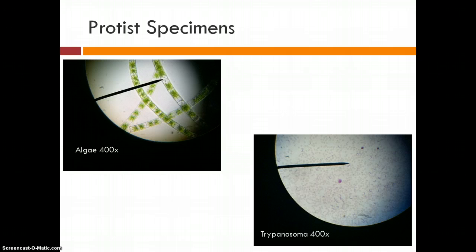So it's important to wear gloves while you're handling the blood smear. Just mentioning this because you don't want to cause infection of any kind, since this is one of those protists that could cause a serious disease.